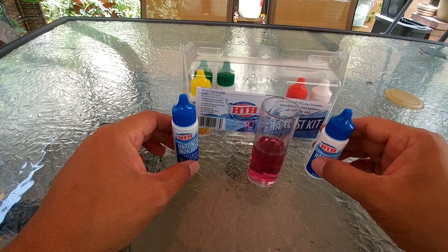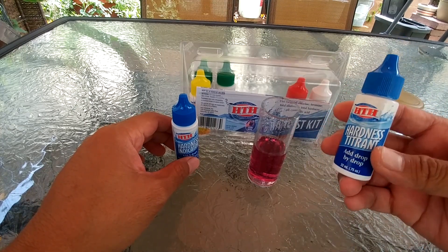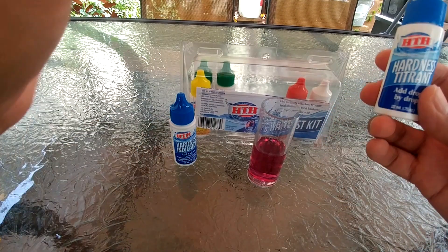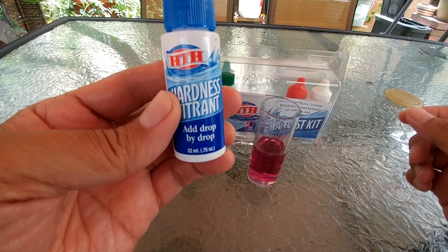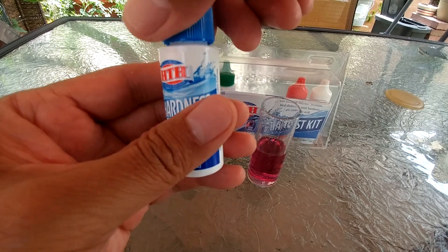Then to get your hardness concentration level you want to add the hardness titrant one drop at a time. Count how many drops you add until the water turns blue, and then multiply that number by ten.